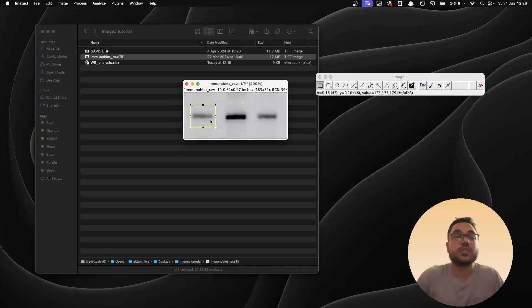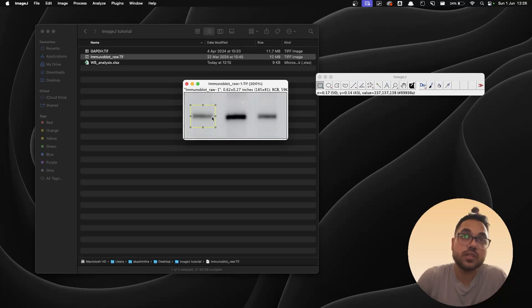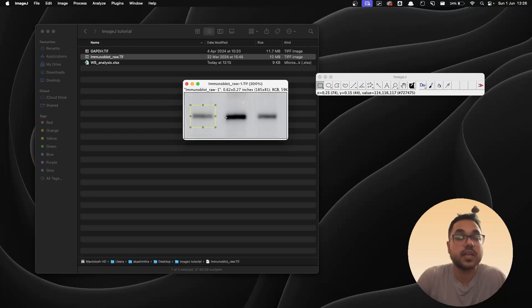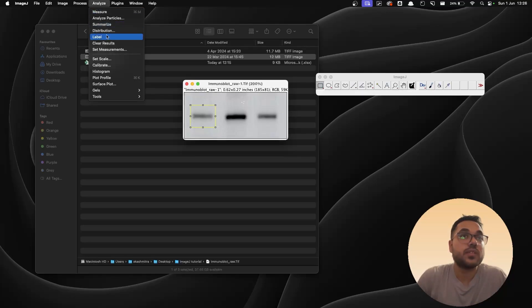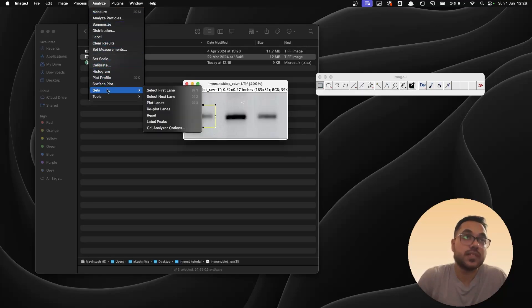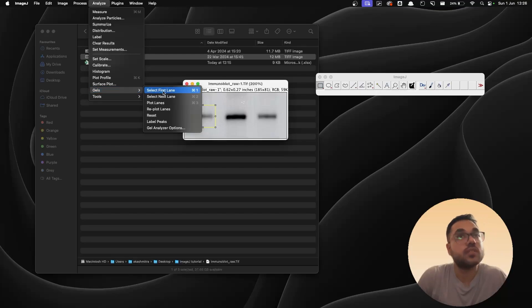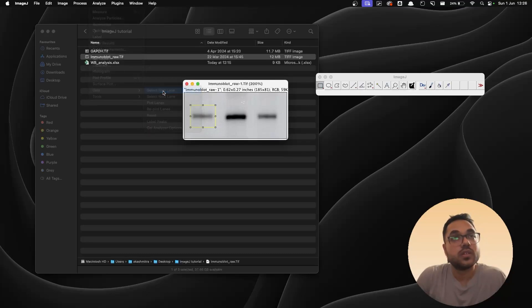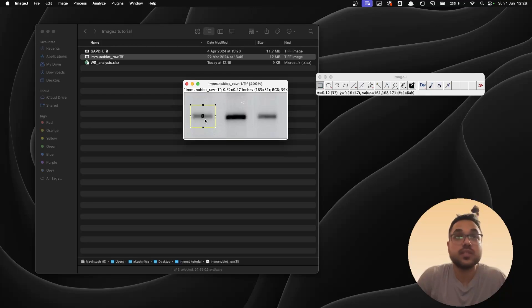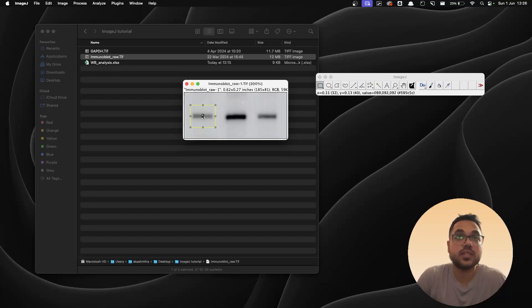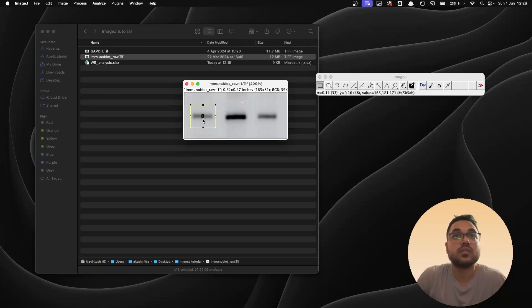Make sure that the whole blot is inside the rectangle, it should not spill over outside the rectangle. Once you do that, you go to Analyze and there's an option called Gels. Inside that you have the first option which is Select First Lane. The shortcut for this is Command+1. So that creates a small one over here in the first lane, and this tells ImageJ that this is the first lane so you can analyze the rest based on the first lane.